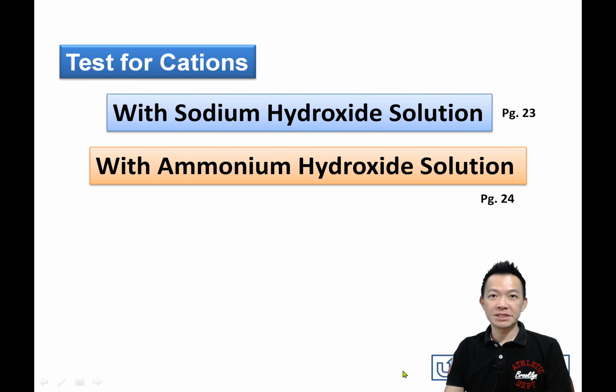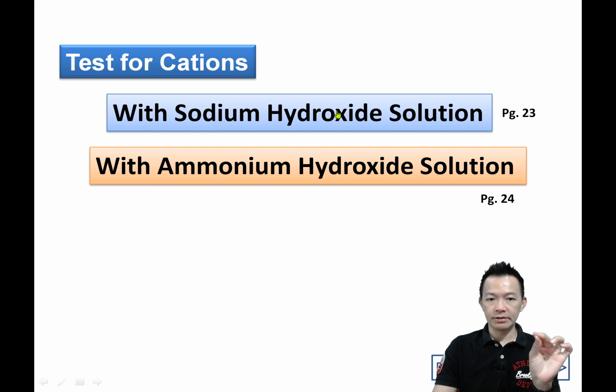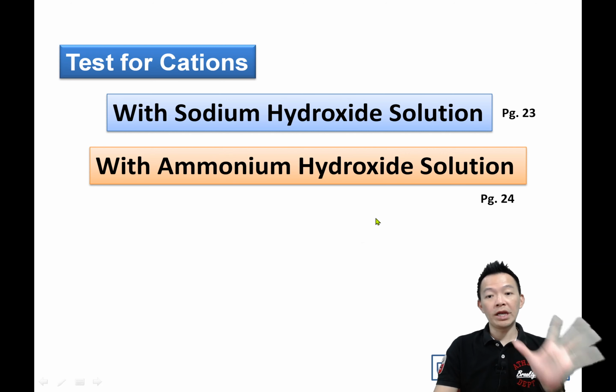Hello, form 4, chapter 6, book 2, video number 29, page number 23. The test for the cation by using the first method called sodium hydroxide. But the best test for the cation will be using two solutions, sodium hydroxide plus ammonium hydroxide, plus some of the specific tests that we're going to discuss later. So, very long title.